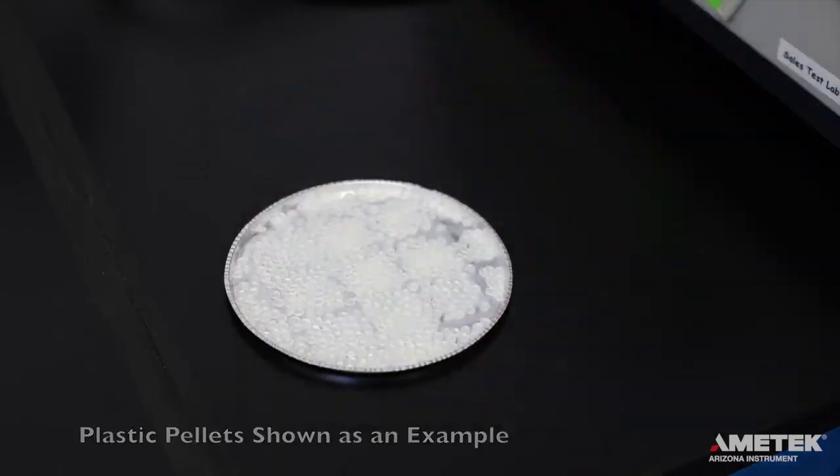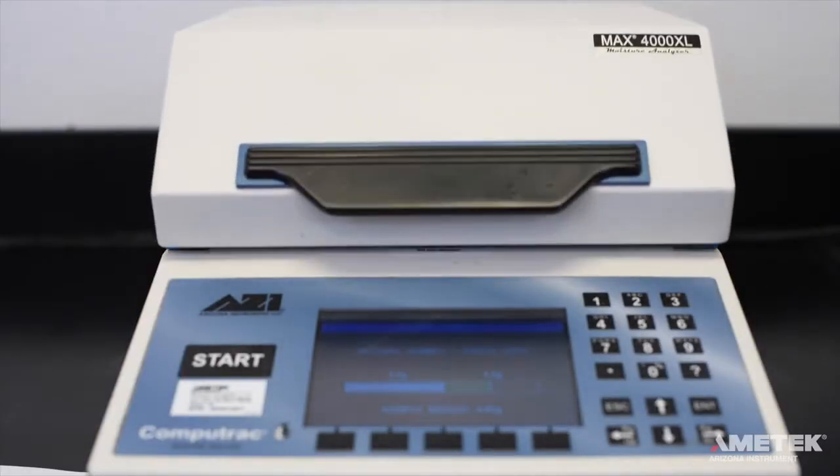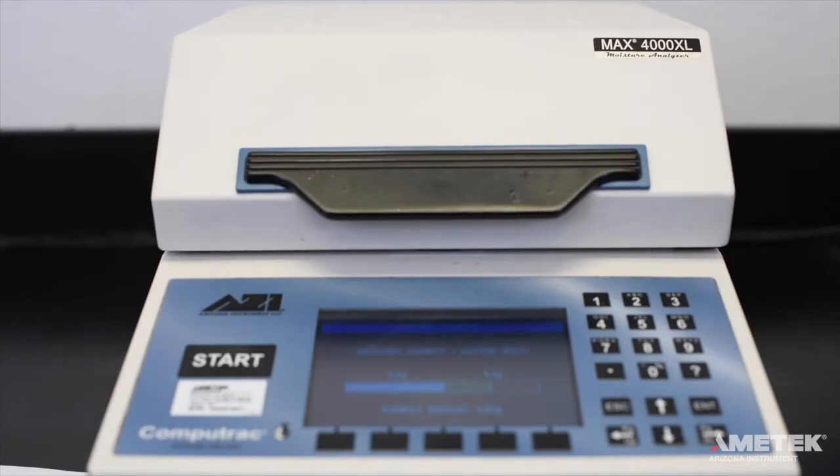Then gently shake it back and forth. After you're done, gently place the pan back on the pan support and close the lid to allow the instrument to record the weight. After the weight is recorded, the test will automatically begin. Now that the lid is closed, you'll notice that the temperature that had dropped while the lid was open is beginning to rise.